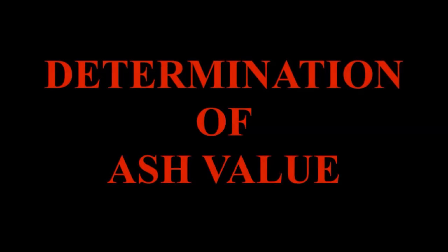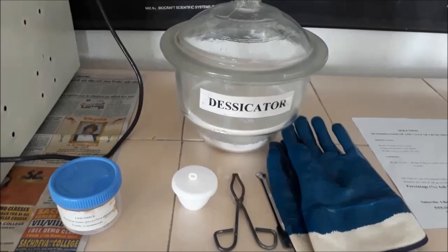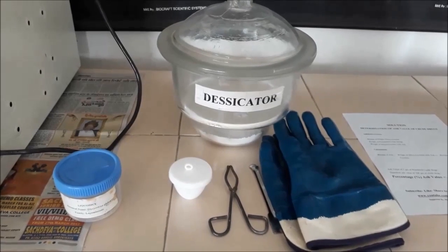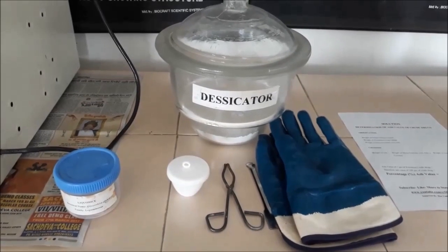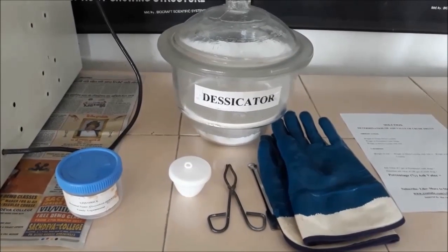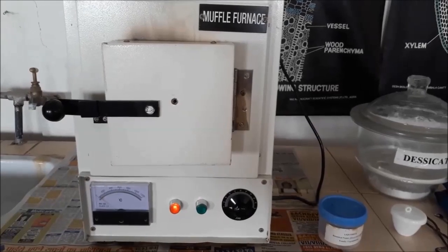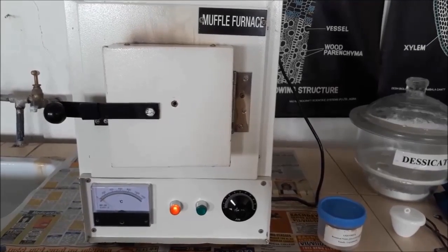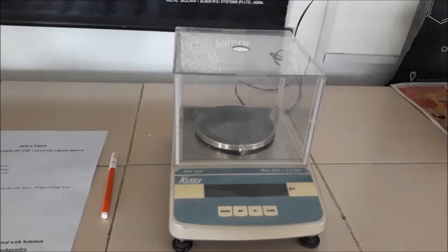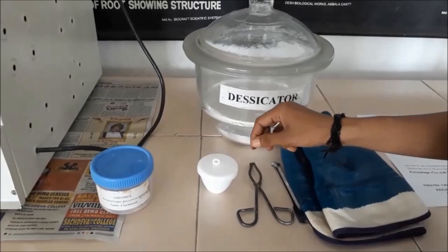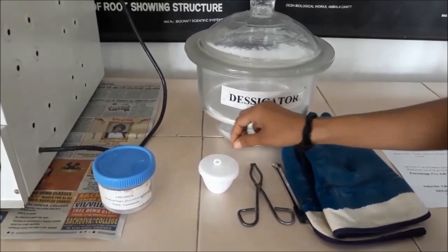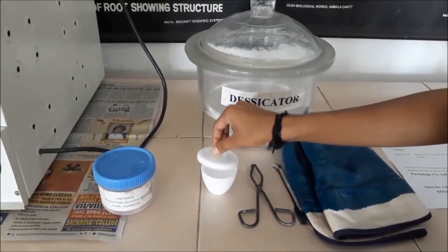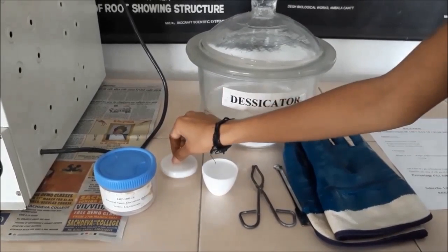Hello friends, today we will show you how to determine the ash value of the powdered crude drug. For this experiment we require: powdered crude drug, silica crucible, tongs, gloves, desiccator, muffle furnace, and digital balance.